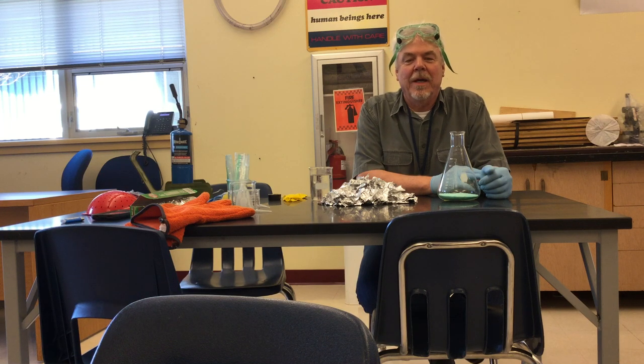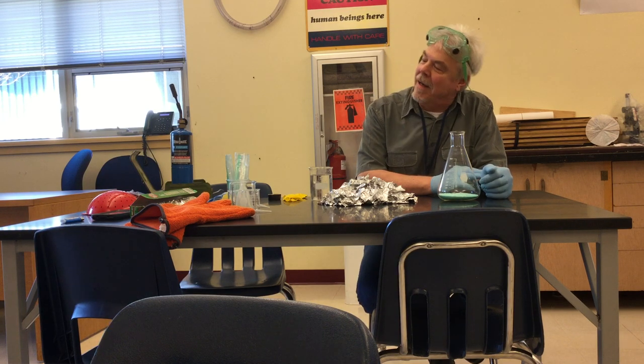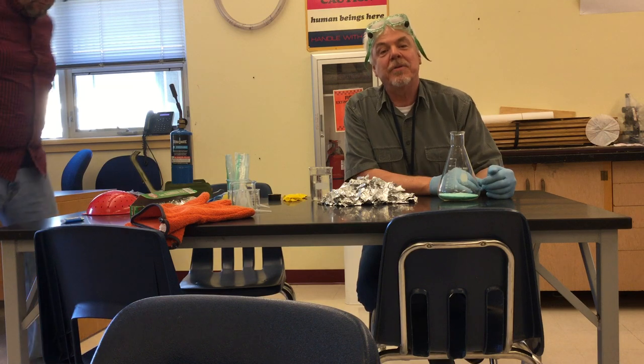We're rolling. Welcome to the latest episode of Fun Blowing Stuff Up. Today, me and Mr. Pole are gonna make hydrogen.